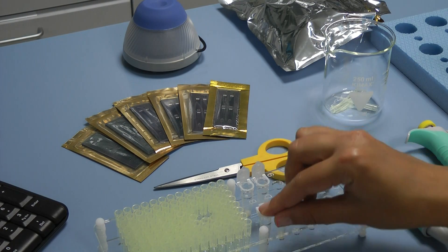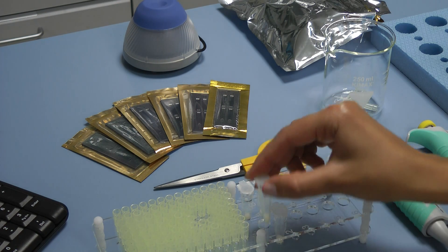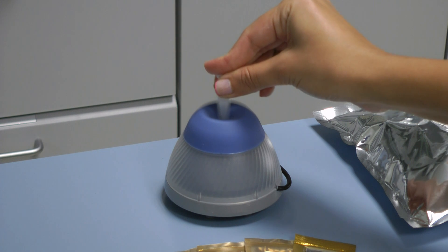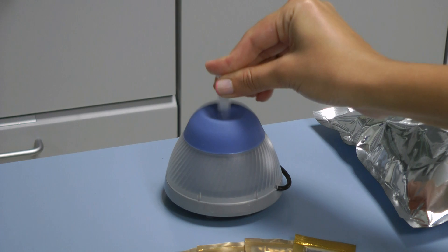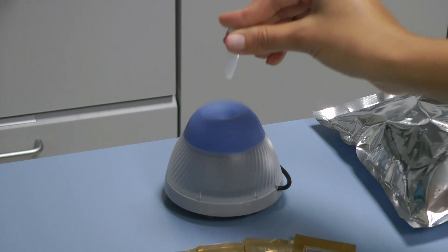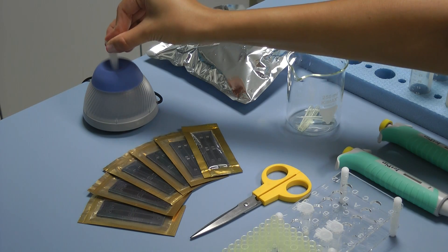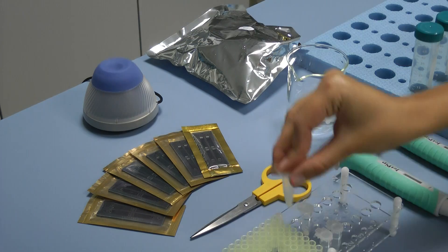After you have finished, close the caps of the microtubes and proceed to the stirring of the reference solutions as you place the tip of the microtube in the opening of the mini vortex stirrer. Press and hold it pressed for 1 or 2 seconds and remove. One minute is needed for interaction of the solution with the dye. If it's less than a minute or more than 20 minutes, the results may not be accurate.